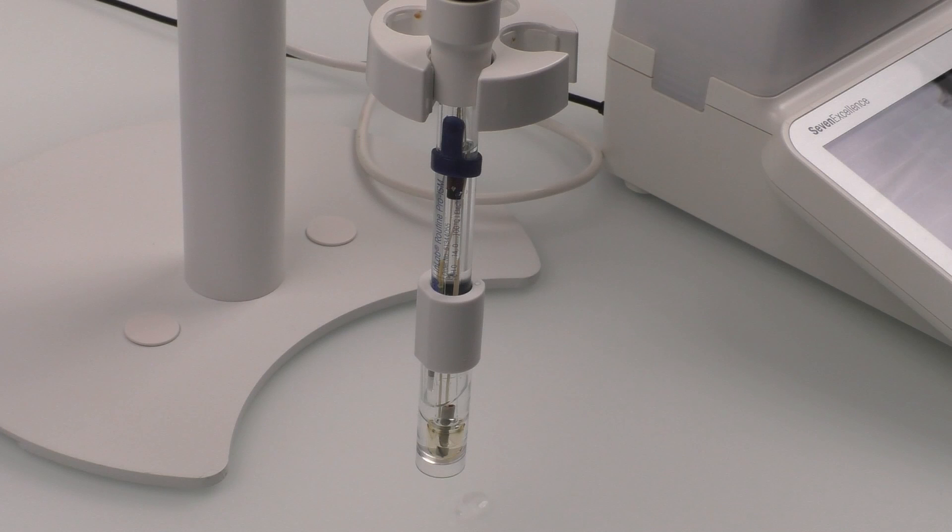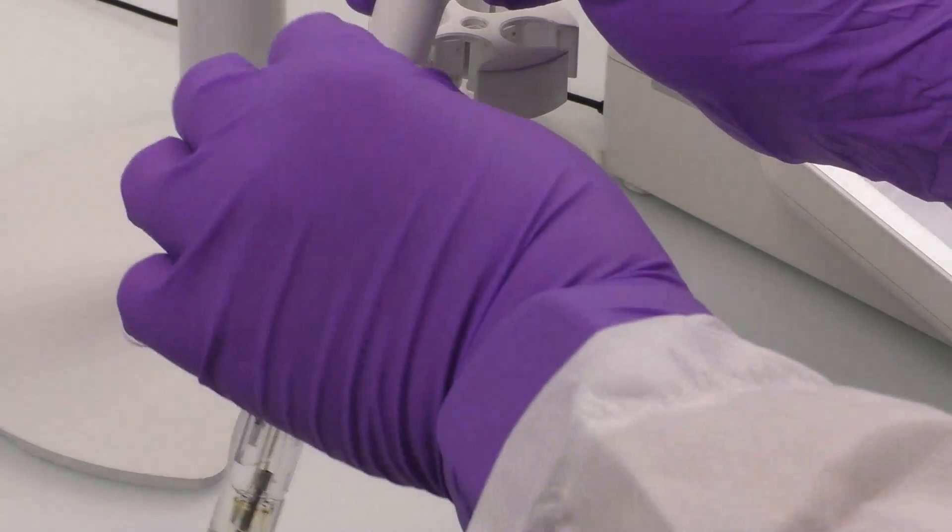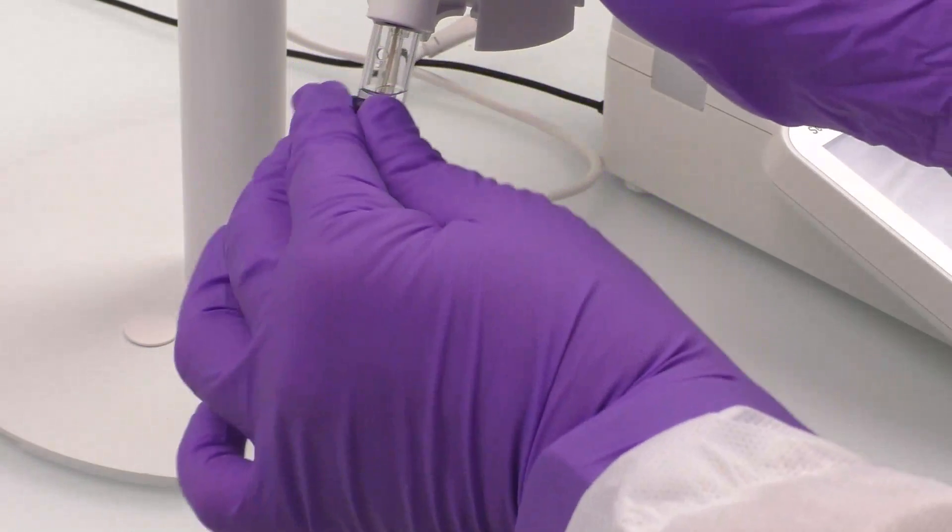Let's get started with preparing the pH sensor for calibration. To ensure accurate results, sensor preparation steps need to be taken before calibration or verification. We will be using an in-lab Pro-ISM sensor for this demonstration. First, you need to open the safety lock so that the electrolyte can flow into the sample.